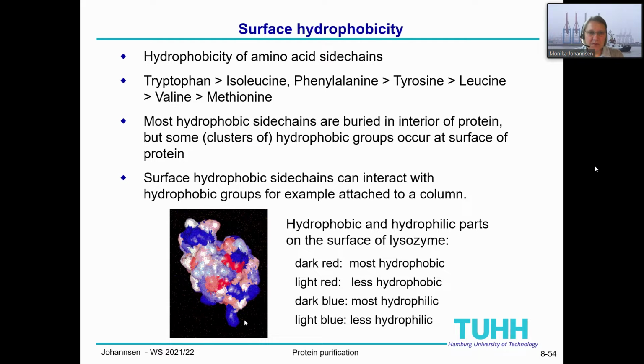And what is the hydrophobicity? On the surface of each protein there are hydrophobic side chains. Most of them are buried inside the proteins, but some are also on the surface.